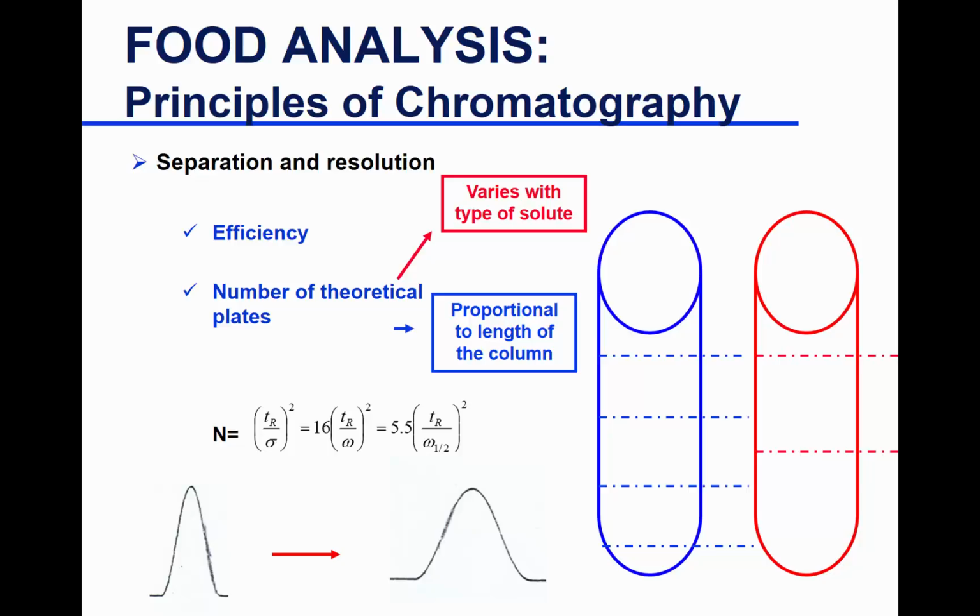Instead of moving as a sharp band, going from a low concentration to high concentration, not diffusing within the column, going in and out and giving you a sharp peak, here it is just diffusing within the column and coming out as a non-sharp, wide peak. It's diffusing more, spending more time in the column, taking longer to equilibrate between the mobile phase and the stationary phase.